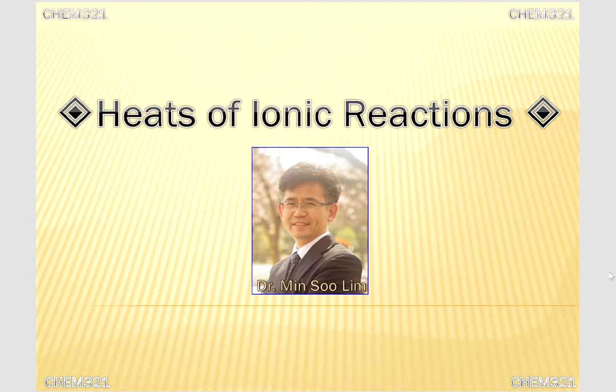I am Dr. Min Soo Lim, and I will show you how to carry out the lab in the experimental and theoretical aspects. You will do a 2-week-long experiment titled Heats of Ionic Reactions. I want you to follow my instruction very thoroughly, slide by slide.